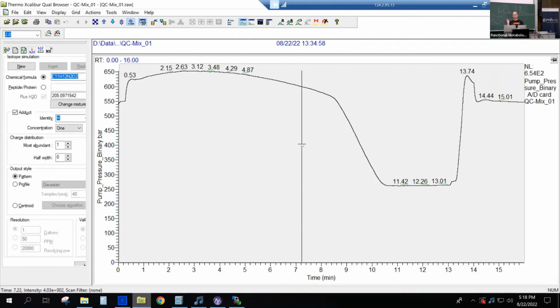Now if any of these phases is too short, I will see this in the pressure profile. I recently saw a photo on Twitter from somebody who had only half a minute of re-equilibration time in his method, sharing a screenshot, and I thought, how does that work? How do we get starting conditions? That is really important, because if you do not have that, then on your next injections everything will run through immediately. You get really bad chromatography.